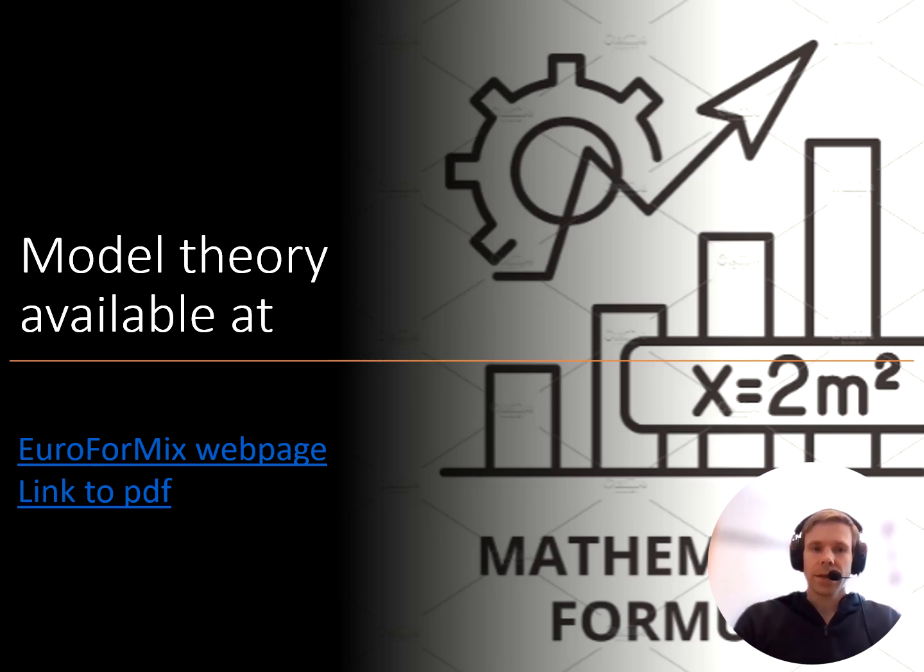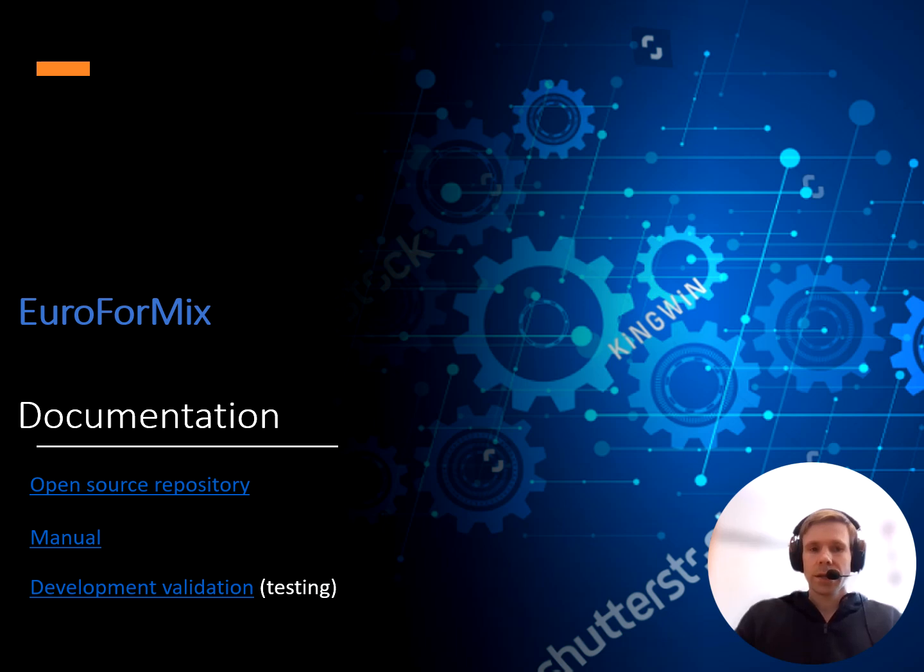The model theory is available online as a separate document. This document describes the model in more mathematical detail. There are also other documents such as the source code. It's available on GitHub. There is also a manual on how to use the software, and there's a description of how the development validation is carried out for each new version.